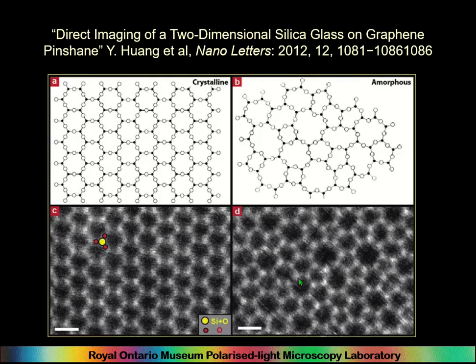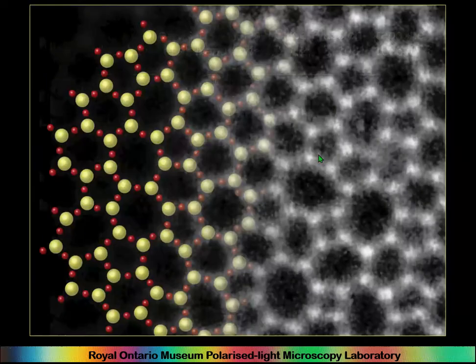And this is an example of someone trying to capture an image of it. This is a crystalline structure, and this is a glass structure. And you can see the silica tetrahedra like a conga line going through the quartz, because you're just moving around, and boom, it's frozen like that. So it's like you're in a conga line and somebody blows the whistle and you have to stop. And that's what glass is. See, this is an interpretation of the elements in the glass.